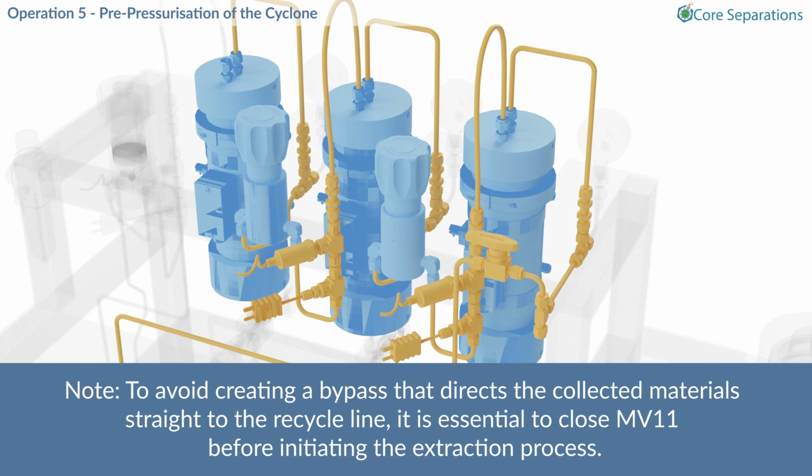Note, to avoid creating a bypass that directs the collected materials straight to the recycle line, it is essential to close MV11 before initiating the extraction process.